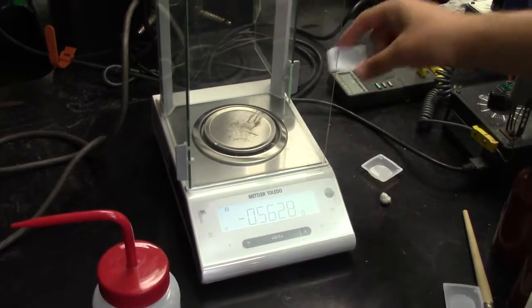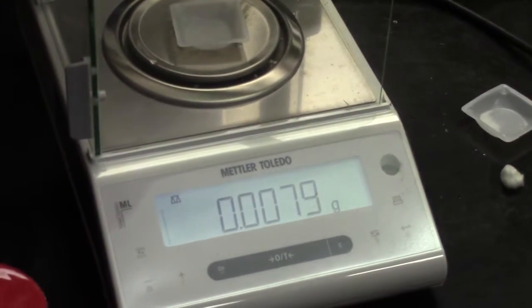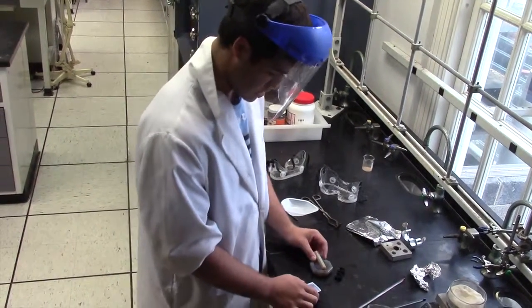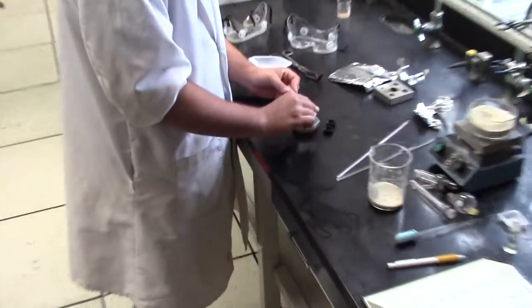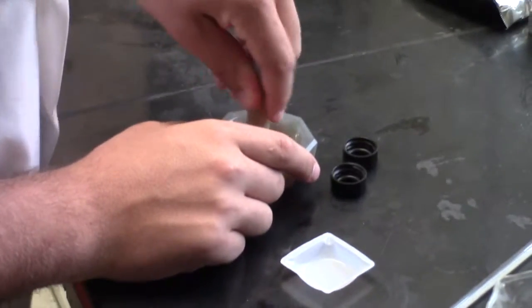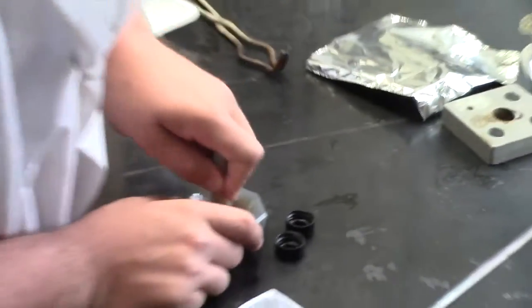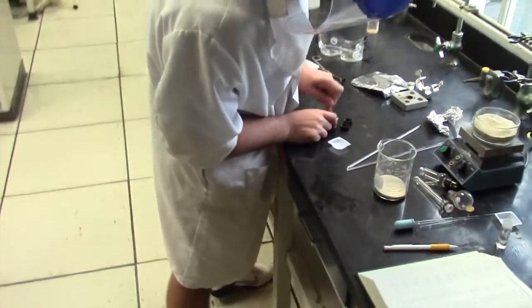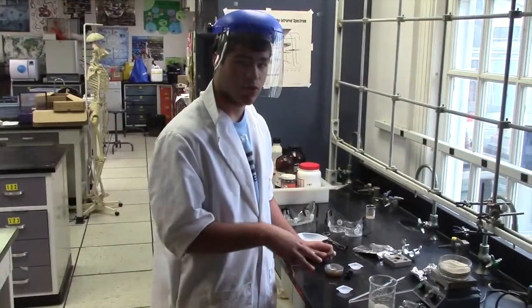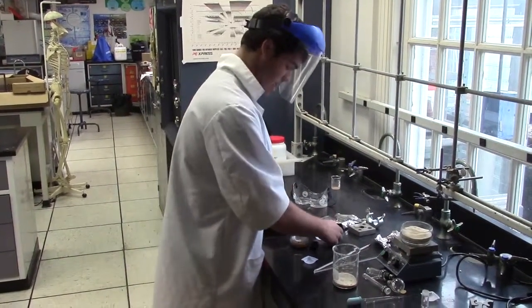And here is our sample. Perfect. Now after your mortar and pestle and nuts and bolts have dried, you can place in your solid sample into the mortar. And then you gotta grind it up. Really get in there, use your hips. And once your solid sample is properly distributed into the mortar, you want to add in your KBr.